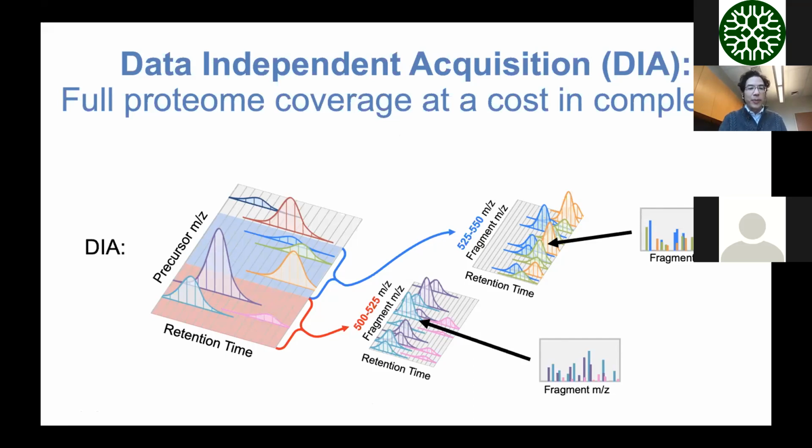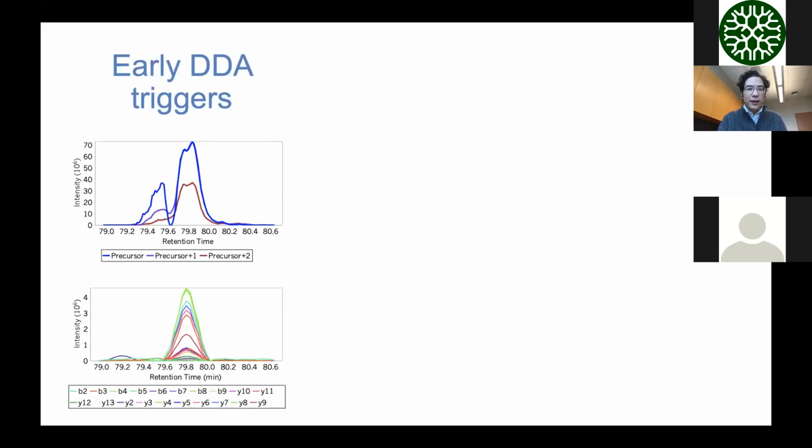So one thing that should be abundantly obvious is that we can't just do this with stable isotope labeled peptides. We don't have enough money, for example, to buy all of the stable isotope labeled peptides in the human genome that we might be interested in monitoring. There's just no way that we could do something like that. And so the way we try to deal with this is by detecting peptides using signals that we've already seen.